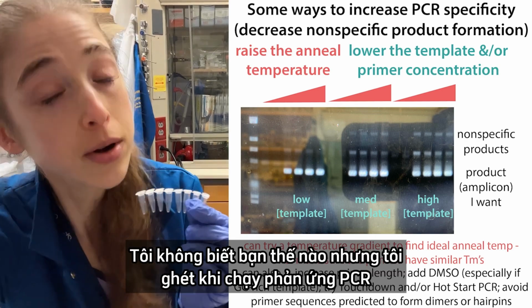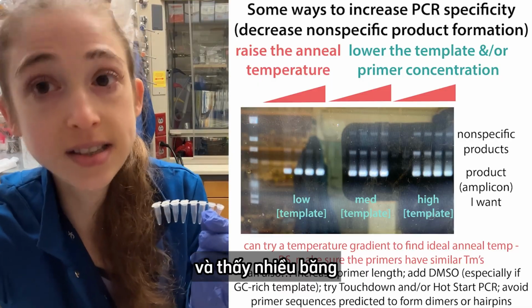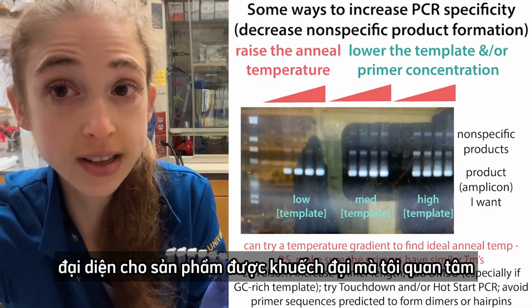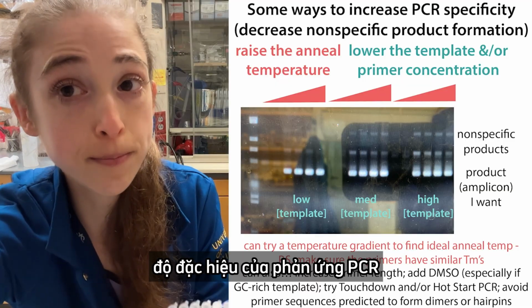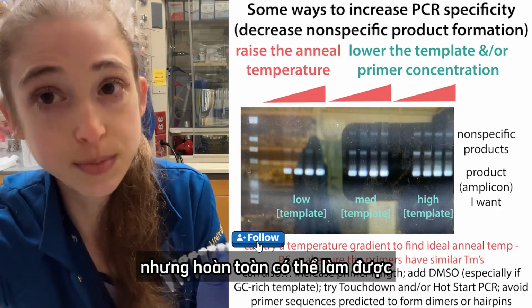I don't know about you, but I hate when I run a PCR reaction and then I go and check the gel and I see multiple bands instead of that one nice band that I want to see representing my amplified product of interest. But don't worry, there are things that you can do to increase the specificity of your PCR reaction. It might be a pain to optimize and troubleshoot, but it is possible.